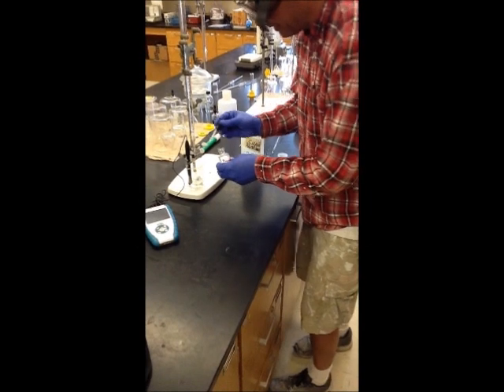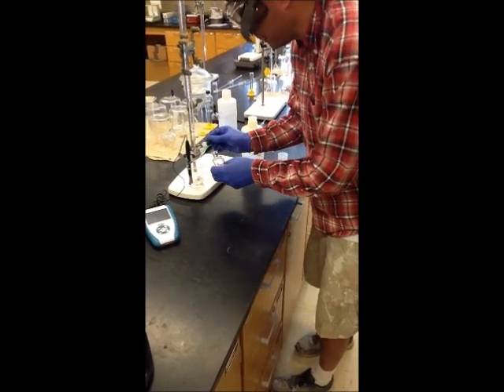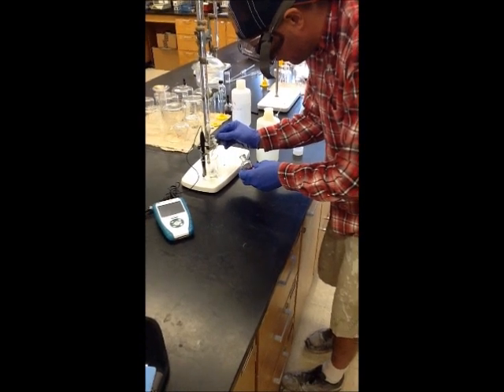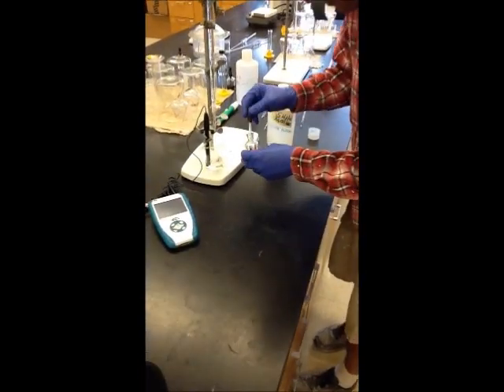Then we add three drops of the indicator phenolphthalein to our acidic solution, and then we begin to titrate.